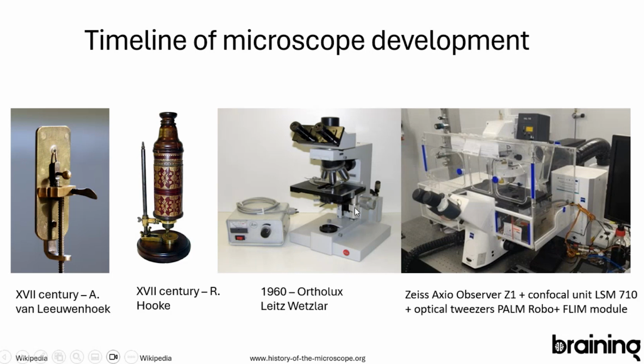They have regulating knobs, stage regulating knobs, where we can move the stage on the XY axis. We can also move it on the Z axis, changing the vertical position of the stage versus the objective. We have advanced light sources, and we can observe our specimen using both eyes, which is a great improvement in comparison with those early types of microscope.